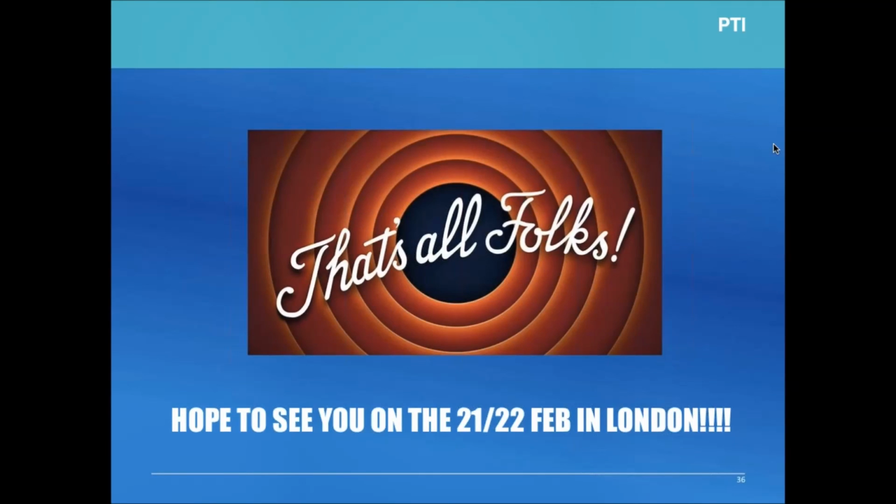So one person asks, what is your experience between assay variability and endpoint methods for CBA? Well, there is one longer case study that we will do in the course that deals with the choice of endpoint methods, and what was seen in that particular cell-based assay was that when you do early endpoint methods versus late endpoint methods, the dynamic range was much bigger.